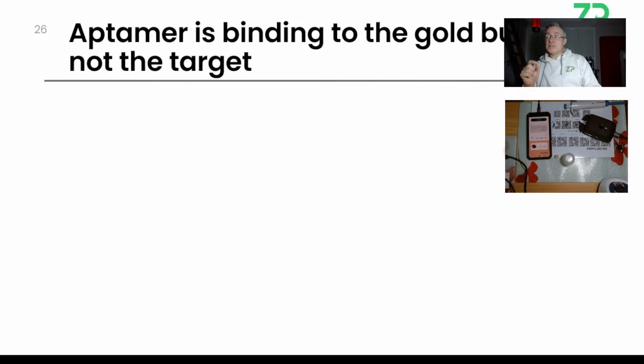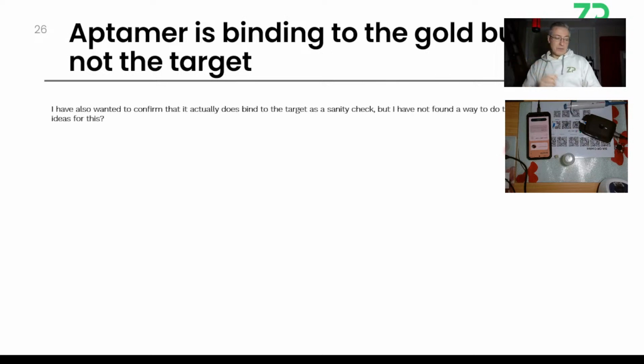Their problem is whether their aptamer actually binds the target, and on binding the target, does it undergo the conformational change? They're thinking this through the same way I would. They said SPR, surface plasmon resonance, may be a way of doing it, and I agree with them, though the problem is the molecule they're trying to bind is so small. It's only about 500 Daltons. Just not going to see it by SPR.